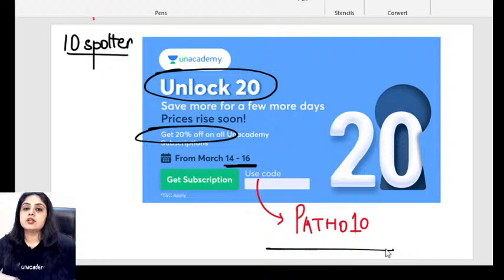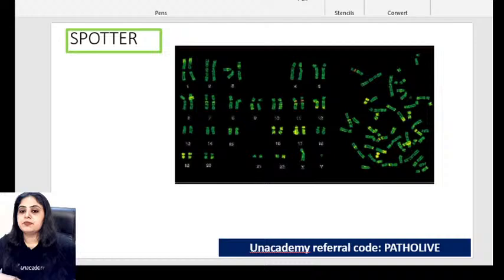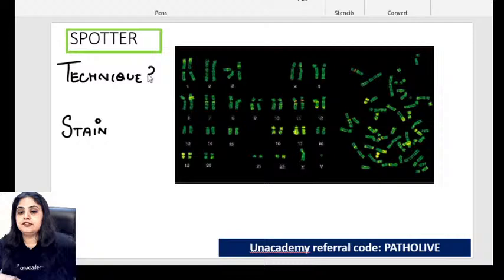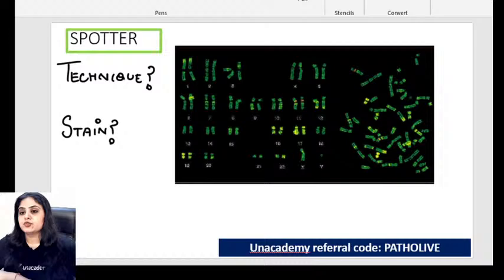Spotter number one — starting with something simple. You need to tell me: what is the technique that has been used here, and what is the stain used for this technique? Those are your two questions for spotter one. No options given, because with options it becomes very simple.